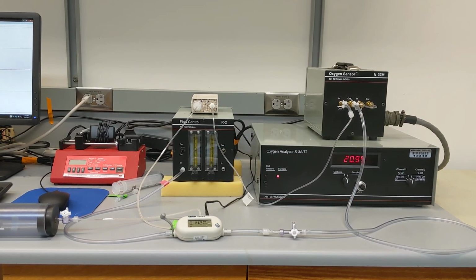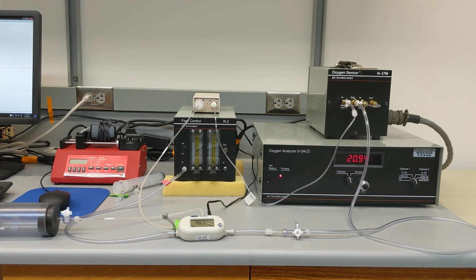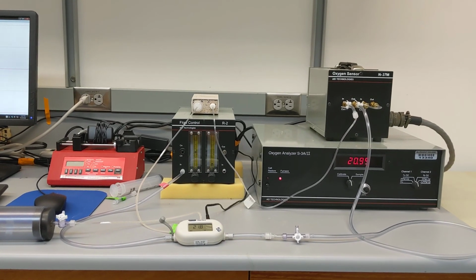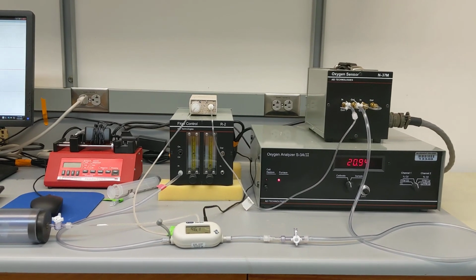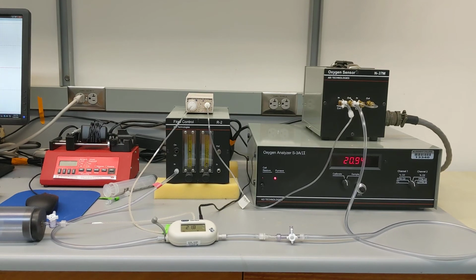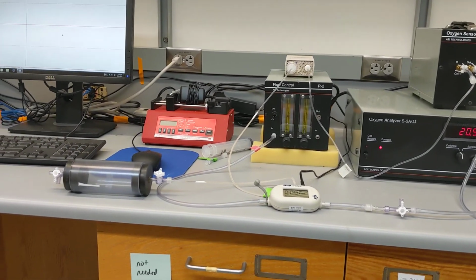All right, folks, so we're here in my lab with my oxygen sensing equipment that I use to measure metabolic rate in organisms. It's a series of pieces of equipment, tubes, and a metabolic chamber. And the basic idea here is that air gets pulled in through a metabolic chamber, this chamber that you could see here.